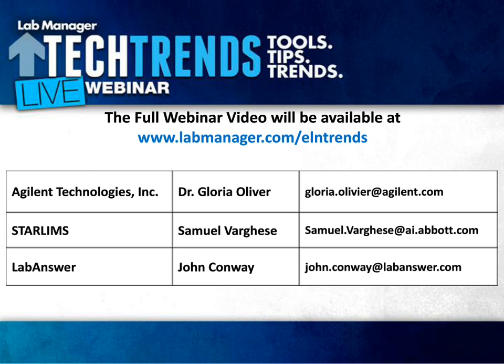So this gets into how do they upload data? Can they drag and drop? Do they have to click through a bunch of menu options? Does it look and feel like what they're used to in the paper notebook? Does it allow them to take what's in their head and transfer it into the electronic format very seamlessly and naturally, in a natural human way? So I think this speaks to the user experience and how the software product is designed to fit with the way the users think and operate on a day-to-day basis.